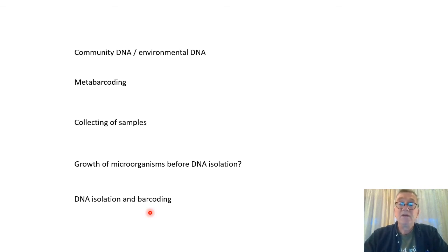And if we could have tagged your DNA, the DNA that you will isolate, then when you are sequencing it later, you can identify which sequence was a result of sequencing of my DNA, or the DNA that I put into it, because all DNA will be mixed. If we tag it or barcode it, we can identify that later. We will talk more about that soon.